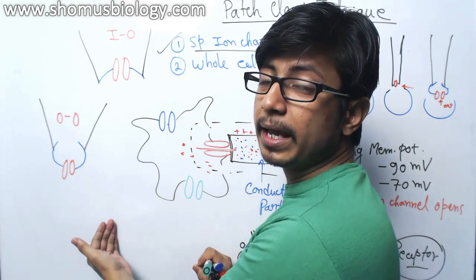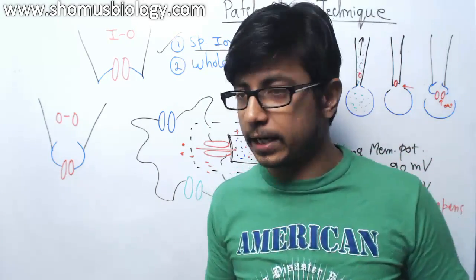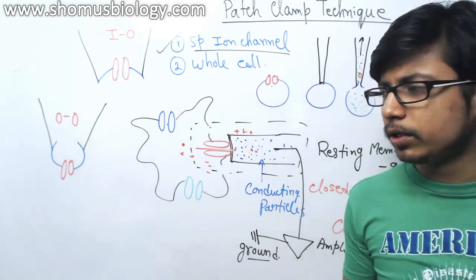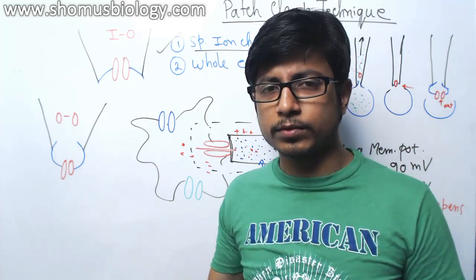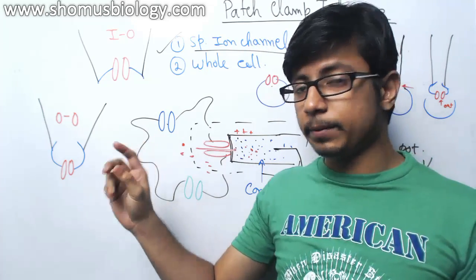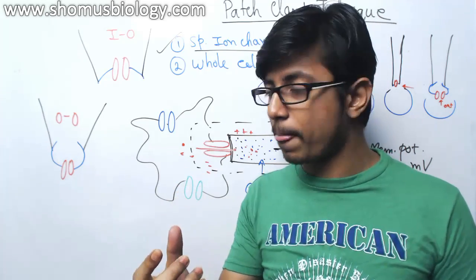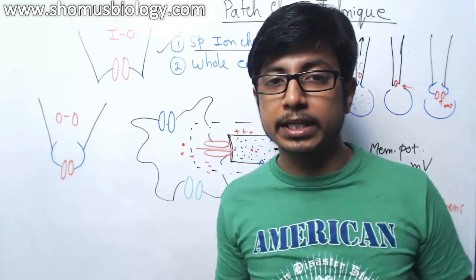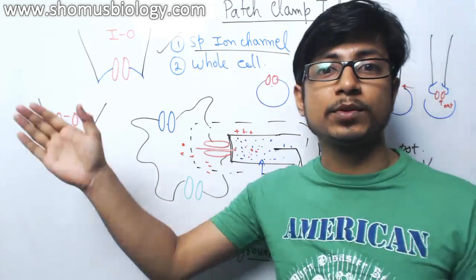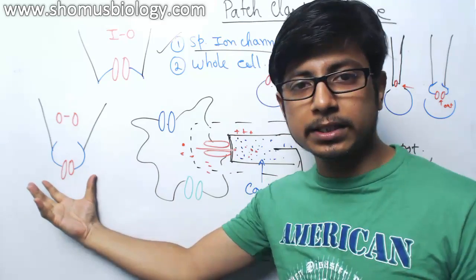to some chemical factors. So if we suspect that this ion channel, let's say ion channel X, is very important, or it has a role involving neurotransmitters, and we know how neurotransmitters work. They move there and bind with some receptor on the membrane that allows one specific ion channel to open. So if we suspect those kinds of activities and are trying to find out the effect of neurotransmitters on different types of ion channels, then outside out is the perfect way to go, because then we separate this fragment.